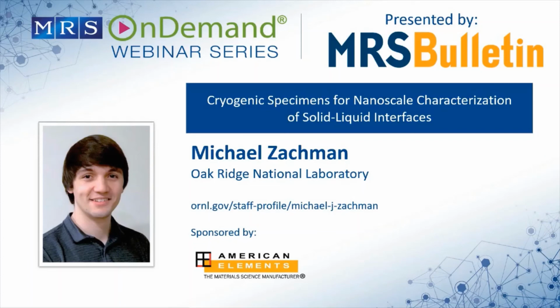Someone's going back to your answer regarding the damage in the gallium FIB. Related to that, they've asked, is there any strain induced by the FIB? You're actually milling the specimen. This person must have worked on some things before.